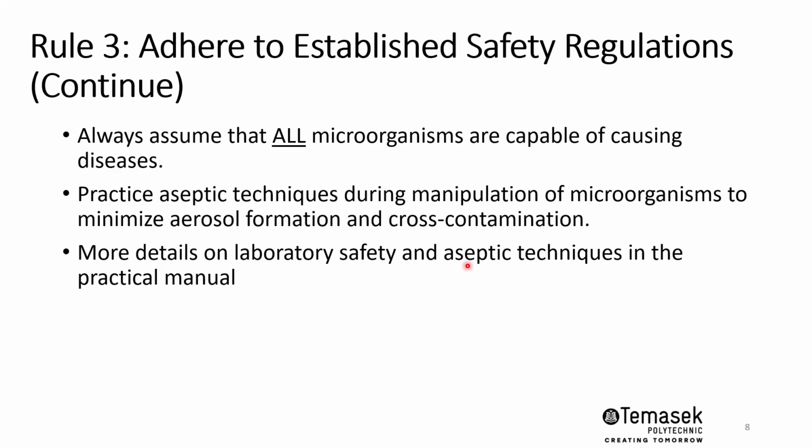Practice aseptic techniques during manipulation of microorganisms. The aim here is to minimize aerosol formation. Aerosol formation means the production of gases or bubbles that can lead to the spread of microorganisms in the air, and also effectively cause cross-contamination between your specimens.